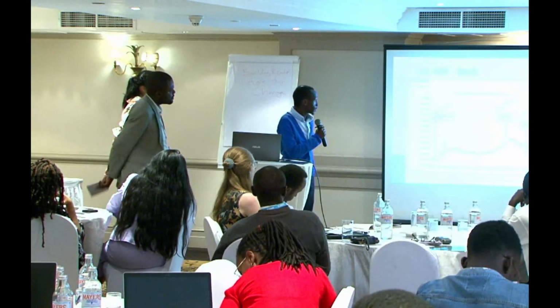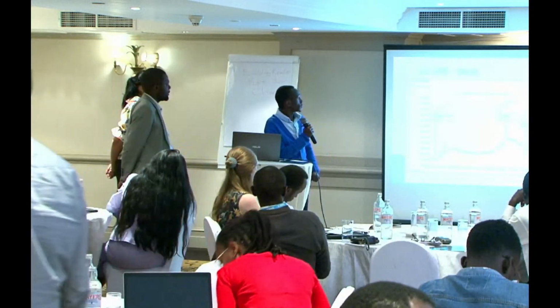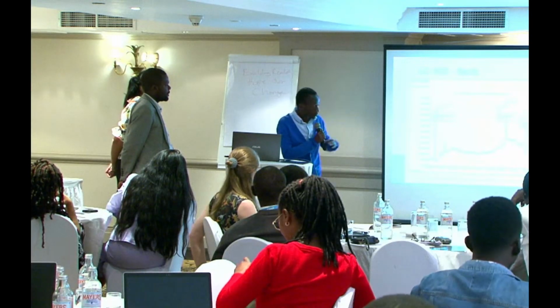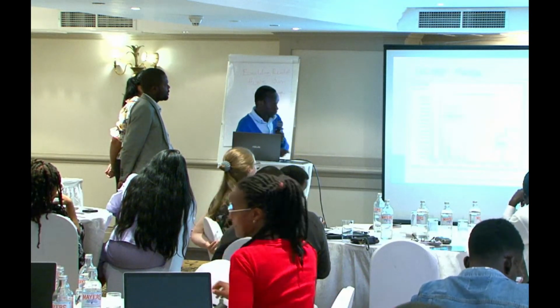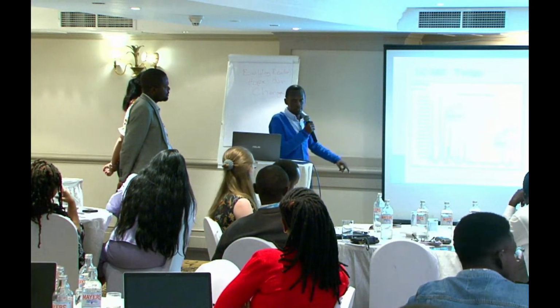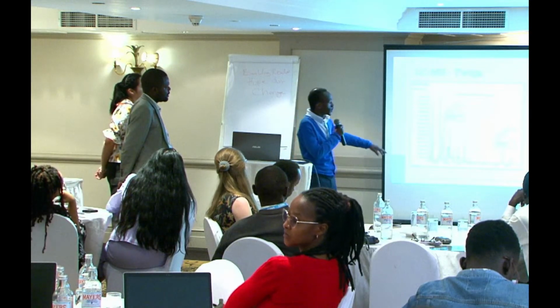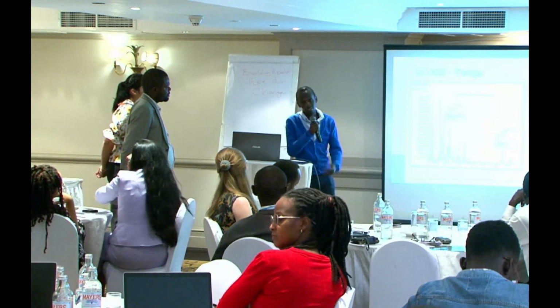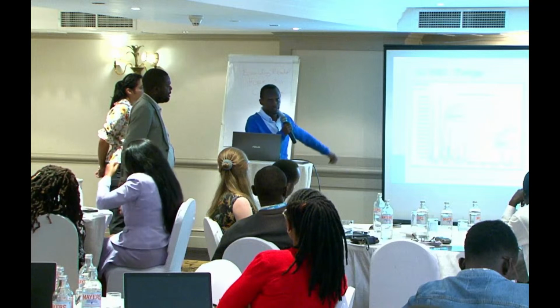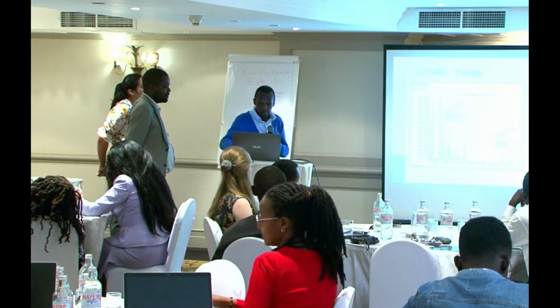You can see 3 compounds. One of them is niloticin acetate, bisphenol A, and isotine. This is from the bark, as we have them there. It's interesting to see the twigs. We also got niloticin acetate as from the bark, and then we had bisphenol. But it's important to see that there are many other peaks that we were not able to detect. Perhaps this is one of the things that we can follow up.